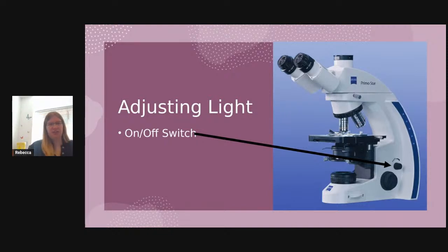And that's just because the grid on our hemocytometer slide is very faintly etched onto that slide, right? We can't see it with our naked eye on that slide, but we know it's there when we look under the microscope. And so having too much light creates, like, when you're trying to look into the sun and you can't see the stoplight out at an intersection, it's like the light that the microscope is catching through the lenses is too much that you don't end up seeing your grid.